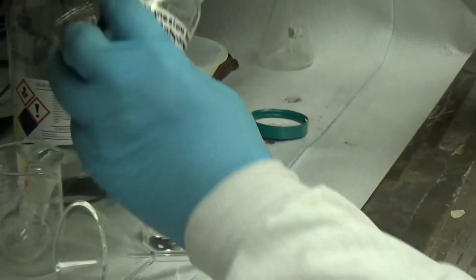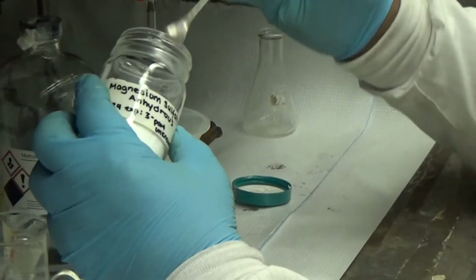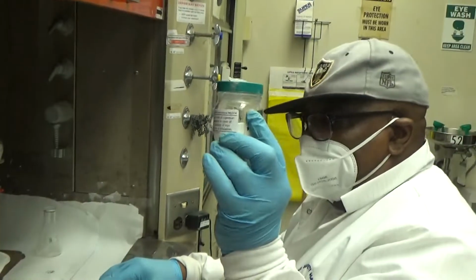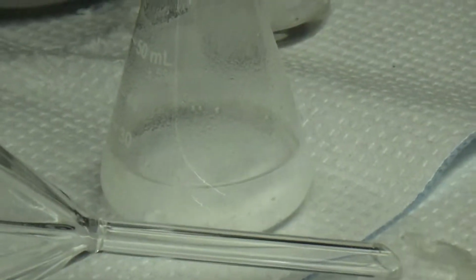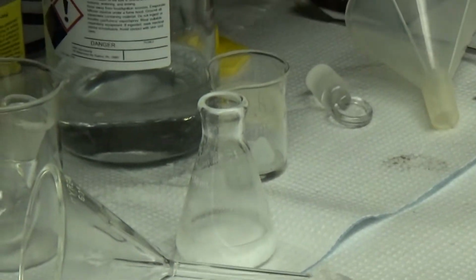I'm going to add two scoops of drying agent. You need to close the drying agent container. If you don't close it, something is going to get inside, like water. So now the magnesium sulfate is swirling around in there, soaking up water to dry the dichloromethane, methylene chloride.